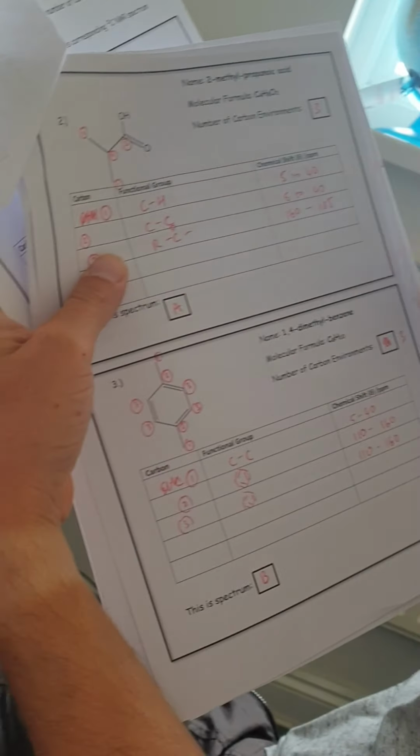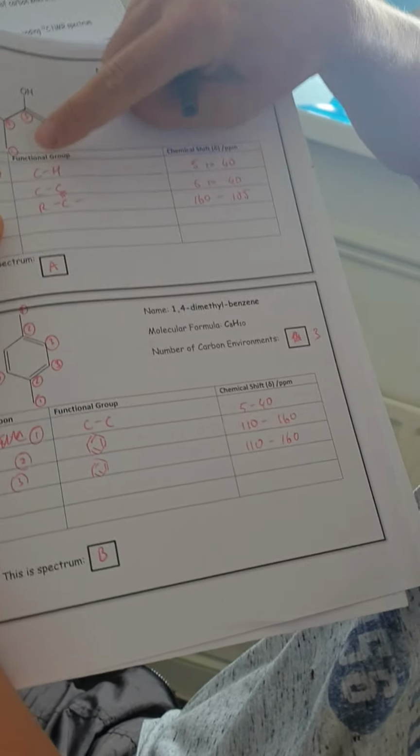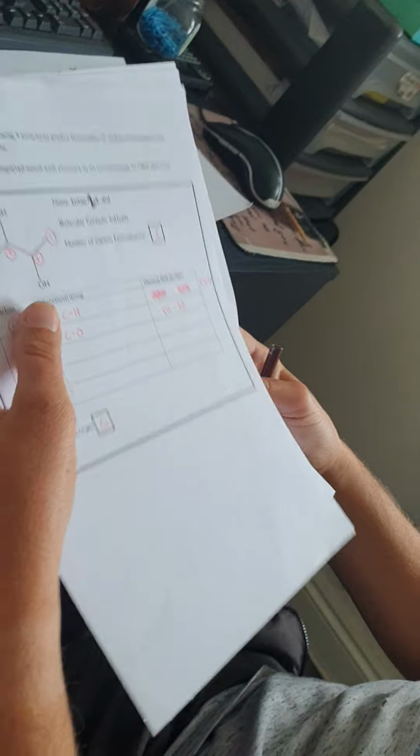So that is carbon NMR. We're looking for the different carbons on a molecule. If the molecule is symmetrical, then they tend to be exactly the same. But you should be able to draw it out and see this. It's just literally looking at the carbon environments. Have another go at doing the spectra. Doing this activity, have a look now at this next molecule, which you should see has 3 different carbons. Now the reason why 1 and 1 are the same is because they're attached to the same group there, and it's totally symmetrical there. I have put the answers on there, but please do me a favour, ask me any questions, because that's my job. I'm trying to help you out as much as I can.